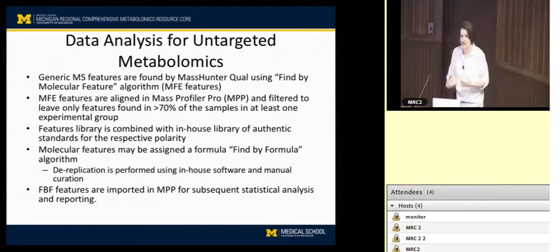And that's how I would analyze the results of each of the different pieces of software. Are we finding all of those peaks in the pooled samples, and what's the standard deviation or relative standard deviation of the areas for all those peaks in those different pieces of software? So it could definitely be done.